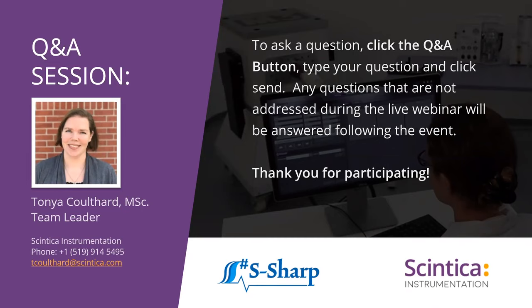Sure. So for those who are more advanced in terms of the physics use, and I see a question around detecting fatty liver disease from Michelle Hempkins. Typically at that point, you're looking at very detailed information about the exact frequencies of sound that are coming back and the brightness and the intensities. So it may be that you need to look deeper into the data, and the system comes with the raw data export capabilities for you to be able to do that, which would probably be the most appropriate way for you to look specifically for fatty liver disease, because that signal is going to come back much brighter, as fat does reflect the sound much more strongly than the liver parenchyma.